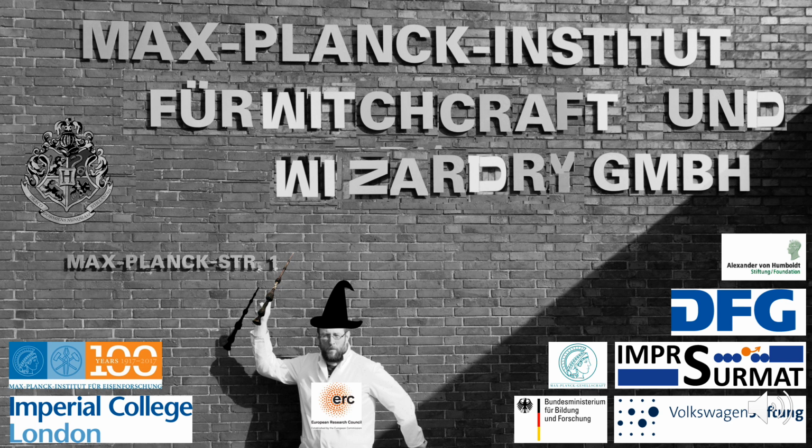I hope it was quite interesting to you. It's mostly work in progress. We've done quite a few steps, but there's many more to come. So we looked at automating the local compositional measurements. We looked at trying to find ways to constrain the reconstruction and calibrate the reconstruction through input from electron microscopy. We looked at also ways to maybe use machine learning type approaches to derive, on field ion microscopy data, where the atoms are sitting with respect to the specimen surface, allowing us to progressively build three-dimensional reconstructions with true atomic resolution, but no elemental identity yet. And we also have some more mapping tools for different microstructural features and grain boundaries that we've submitted for publication.